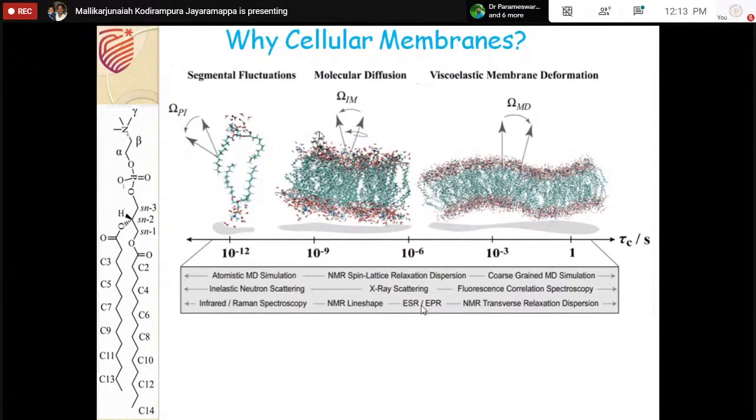The fundamental example I always give is that if you take a photo, you will only see my position at that particular instant of time. On the contrary, if you do NMR spectra and perform relaxation time measurements, along with my static picture, while I am speaking as of now, you would see how my hands are moving, at what speed I am moving my hands, and the time scale at which my lips are moving whenever I am speaking.